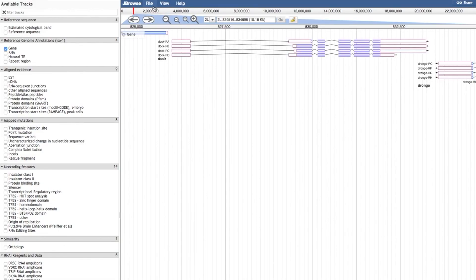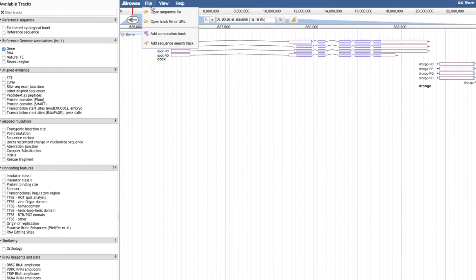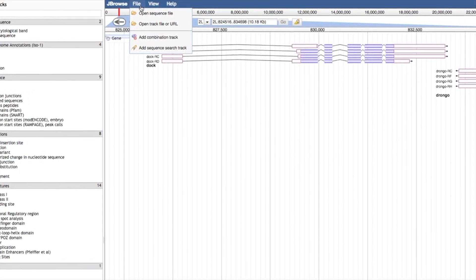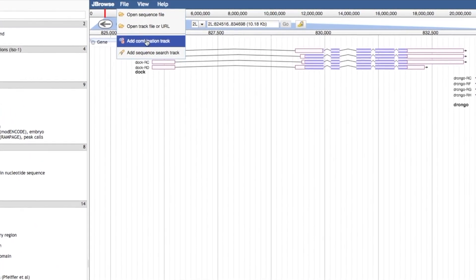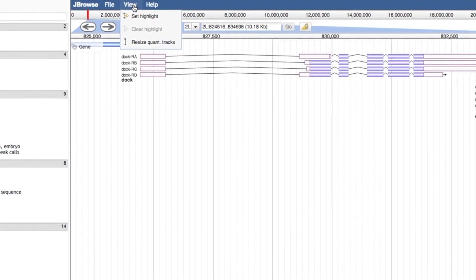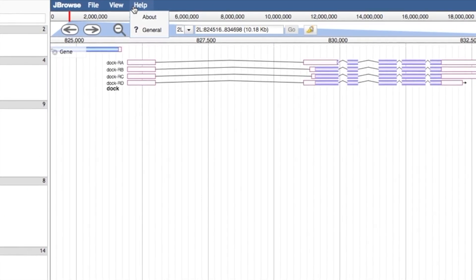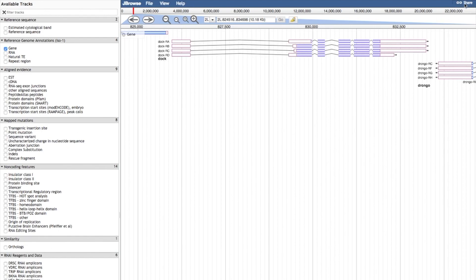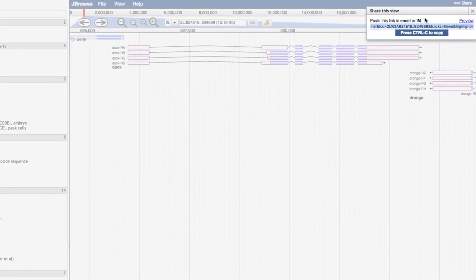The Genome Browser is split into two major sections: the Available Tracks menu on the left, and the Genome Viewer on the right. The Genome Viewer has various options, including File, View, and Help drop-down menus along the top. The File option can be used to open or add to your custom tracks or sequences. There is also an option to save and share your screen as a URL on the far right.